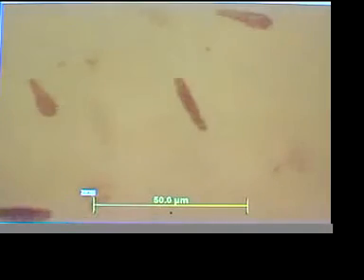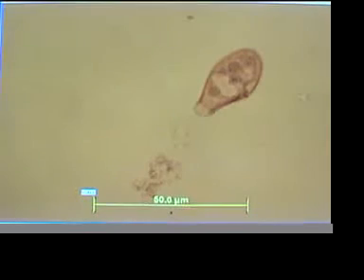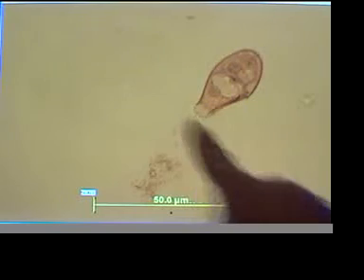Anyway, you see quite a few have already started to slow down. There's one who got devitalized over there, but we didn't get the film, you can tell by the shape. Okay, we'll concentrate on filming the devitalizations now. Here's one happening very slowly. I think there is some very slow action here. Very slow formation here.